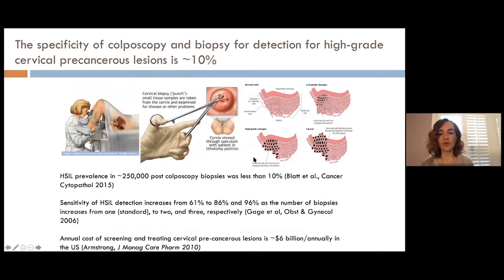So the first example I'll show you is from a study that we recently published that focuses on the use of label-free two-photon imaging to identify precancerous lesions in the cervix. The human cervix is a squamous epithelium, so there are many layers of cells at the surface. As a result, typically, of human papillomavirus infection, there are some genomic changes that then lead to morphologic and functional changes that occupy, ultimately, when you get to the high grade squamous intraepithelial lesion state, the entire epithelium. And then ultimately you have invasion and metastases.